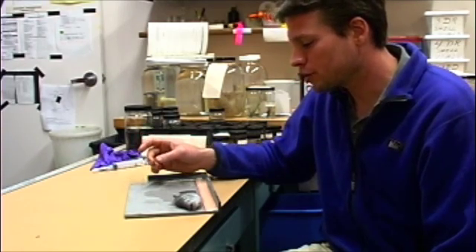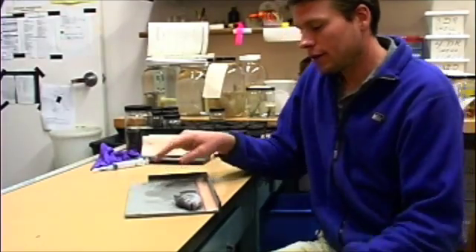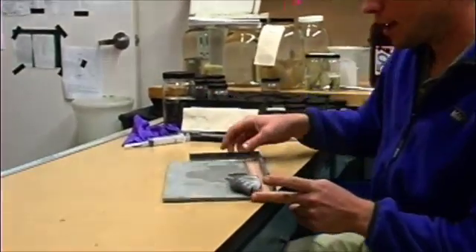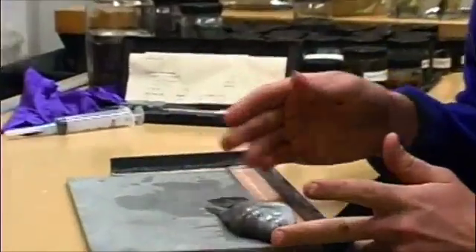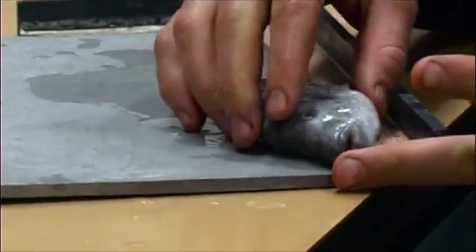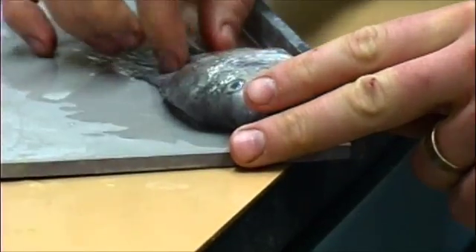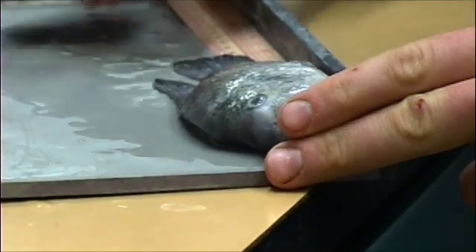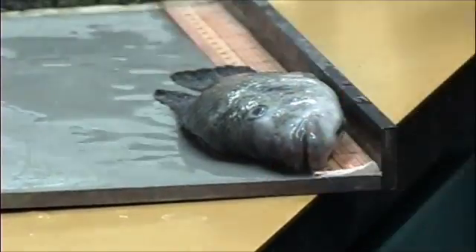The first thing I'm going to do on this fish is take some measurements. The first measurement I'll take is called total length — that's basically the length from the tip of the snout to the end of the tail. It's 180 millimeters.